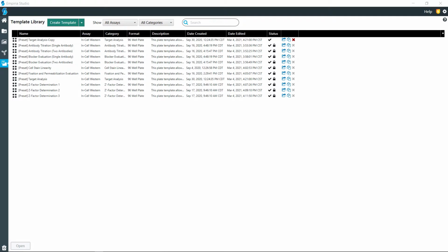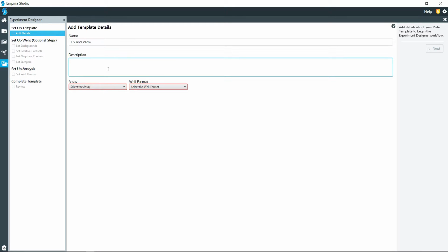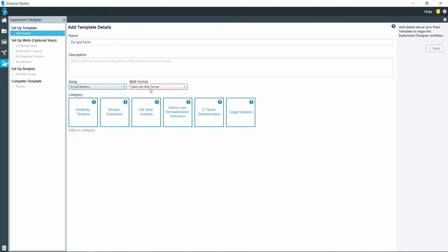In this video, I'll be walking you through the steps involved with fixation and permeabilization evaluation for the In-Cell Western. So up here at the top, we're going to click on Create Template. And then give it whatever kind of description that you would like. And for this template, we do need to choose In-Cell Western. And then we're going to choose the 96 well plate format and fixation and permeabilization evaluation.